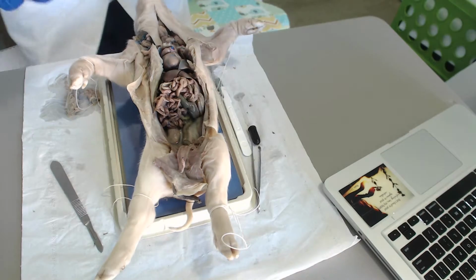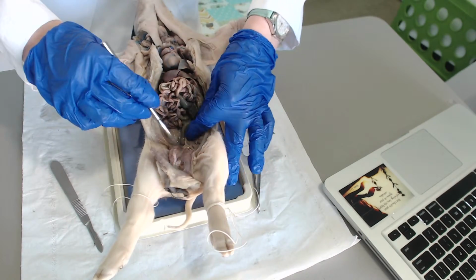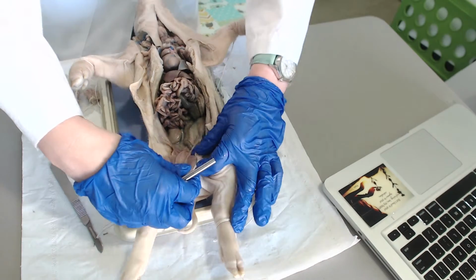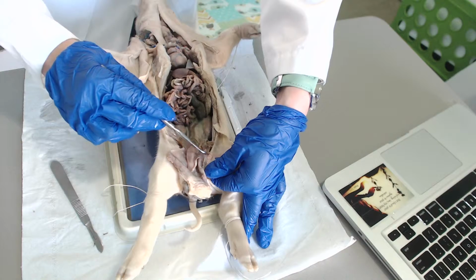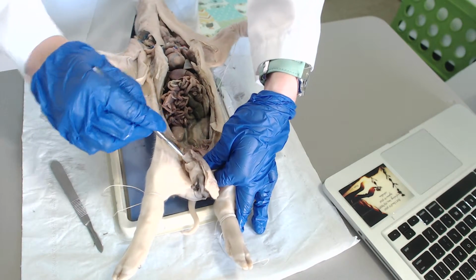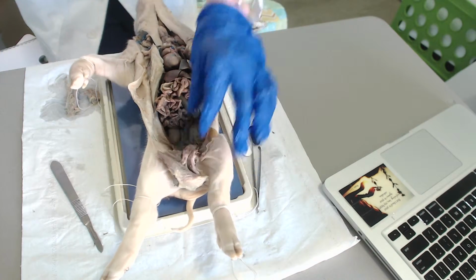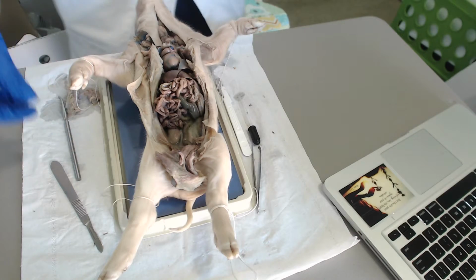Okay, and so since we have a male, we have the penis right here, and we also have the testes. So the testes are located right here. You can kind of feel there's 1 on each side, and kind of closer together. Okay, so that is all of the portions. Now we're going to pause the video.